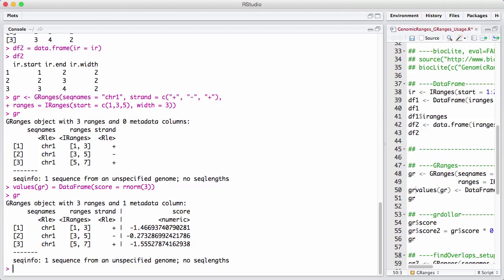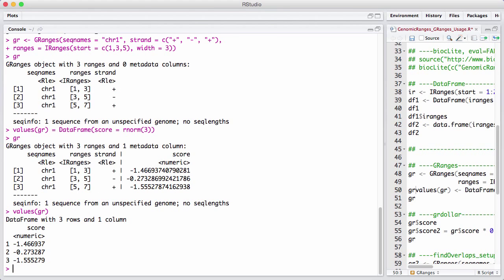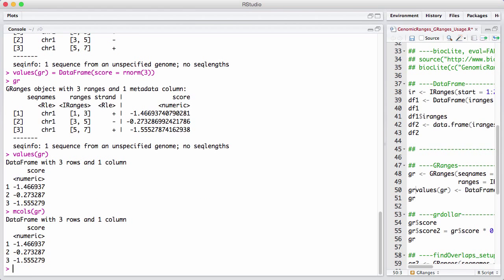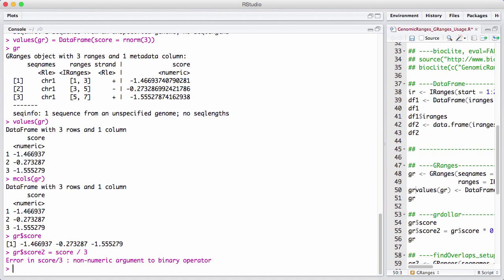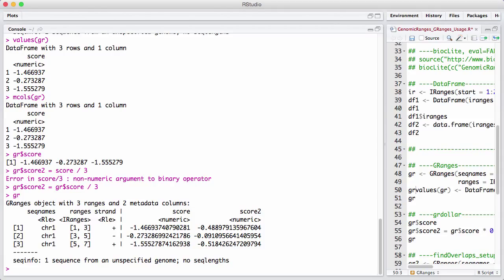Now I have a metadata column with a score — I could have had additional columns. It gets filled out, and I can access it with the values of the GRanges. I can also use mcols, which is basically synonymous. Even more conveniently, I can use the dollar operator to access a different column, like gr$score. I can even use that to assign a new column — for example, score2 equals score divided by 3 — and now I have two different columns. This is highly useful.